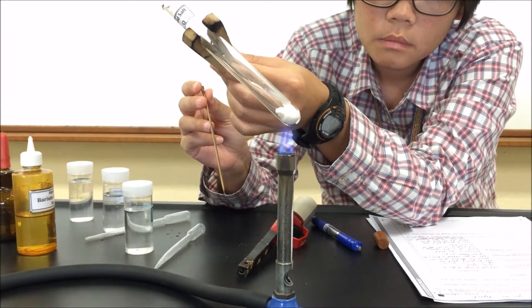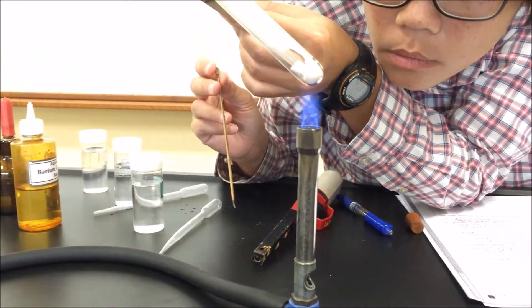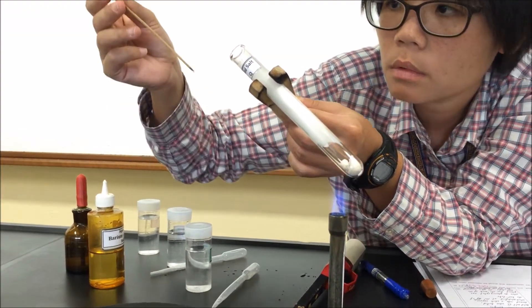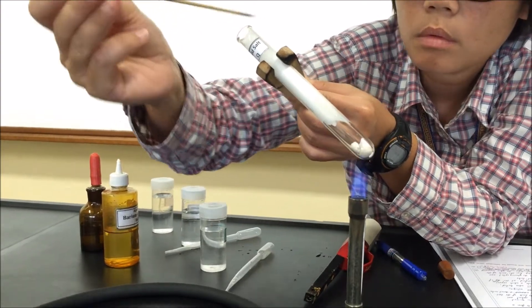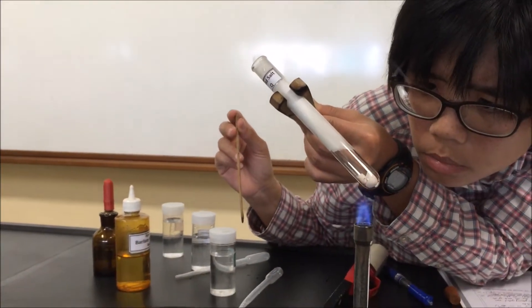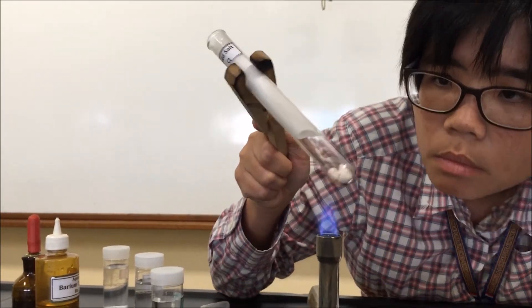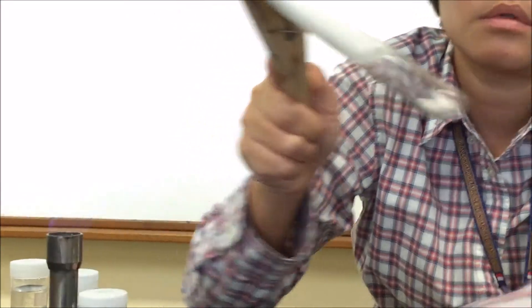We also see white solid condensing at the sides of the test tube, so we will note that down in our answers. Because of the white solid condensed at the sides, it is harder to see the glowing splint test, but we will still try our best to observe — and it does not relight. So it is a negative test for the glowing splint. There is white fumes and white solid condensing at the sides, and some white solid remains in the test tube. This is the result of Part A.